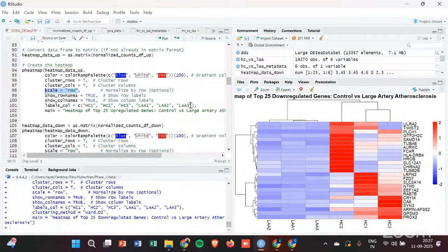You could have very high log fold change values, and that is why DESeq2 has a method to shrink those values down. It performs some more complicated statistical tests. Even I don't remember exactly what it does to do the shrinkage, but it tries to shrink down the log fold change values so that they are in a respectable range. In my opinion, and this is what I had done for my latest project, with one of the data sets, I got extremely high log fold change values, which was expected, because I had a lot of outlier genes as well.